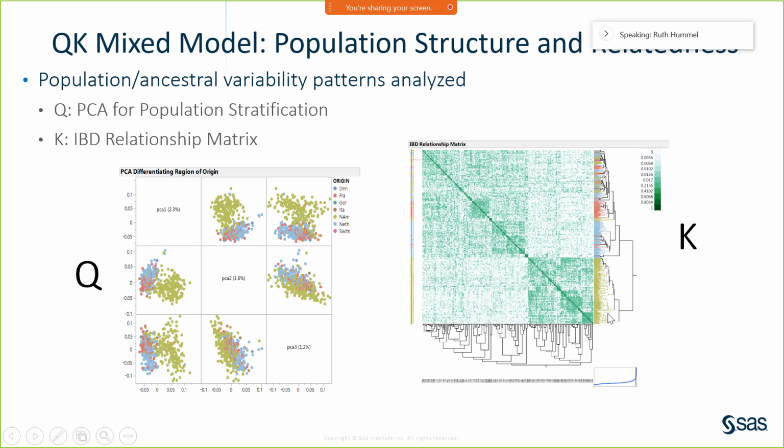We see those same colors over here in the dendrogram. So there's high similarity between the North American dogs, pretty high similarity in the Denmark dogs, pretty high similarity in the French dogs, although there's a little bit of dogs being placed in different groups up here. So we're seeing that there is relatedness and similarity in their variance based on relatedness. So if we can explain that first, then when we do these tests, we're going to see, in addition to what could already be explained by relatedness, how much more does the cancer relate to these different SNPs.